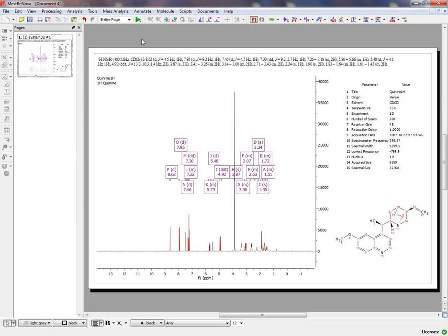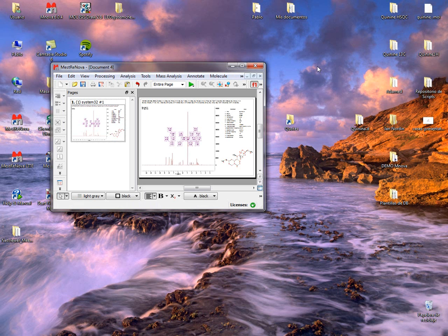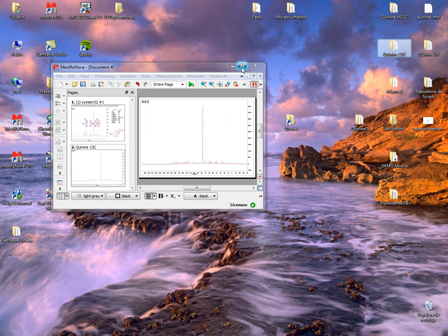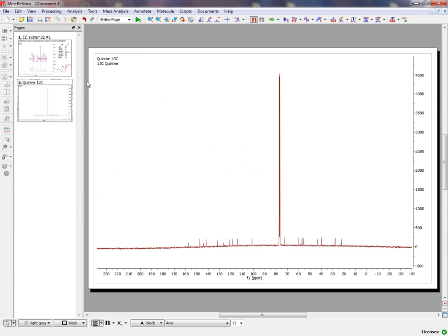So now you have your Proton NMR Spectrum fully processed with the Multiplet Report and ready for publication. Now we will open the Carbon NMR Spectrum just by drag and drop.